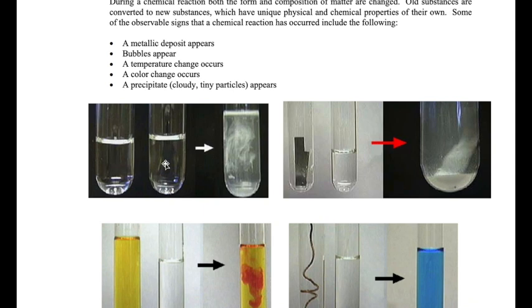So contrast these two solutions, which are the reactants for the reaction, and then once they're mixed together, look at the appearance of that cloud. That cloud is the precipitate, and that's the product that's formed as a result of the mixing of these two solutions. These two solutions are transparent. We can see through to the other side of the test tube where there's that black background. And with this one, we can see that that black background is not as clear now because it's obscured by these small particles, or precipitate, that's blocking our view.